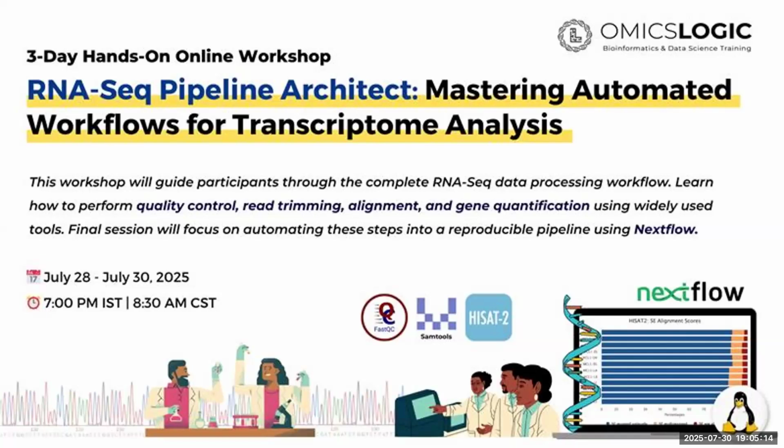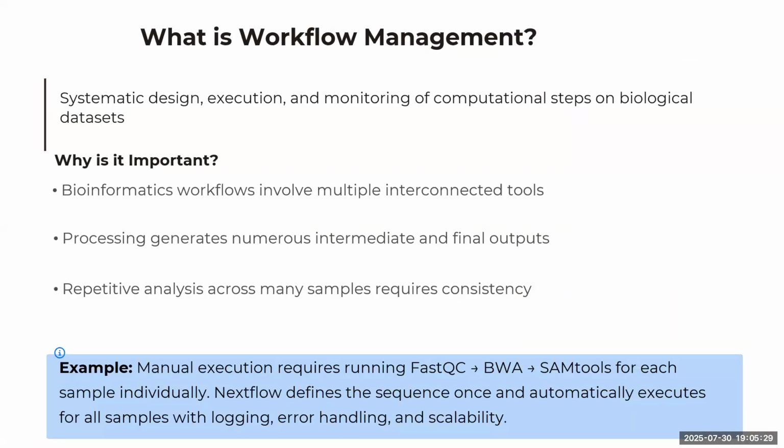Perfect. So, for the last 2 days, we were establishing a base so that we can understand what the RNA-Seq pipeline is. And today we'll talk about the automated workflow. Before talking about Nextflow, let us talk about what workflow management is.